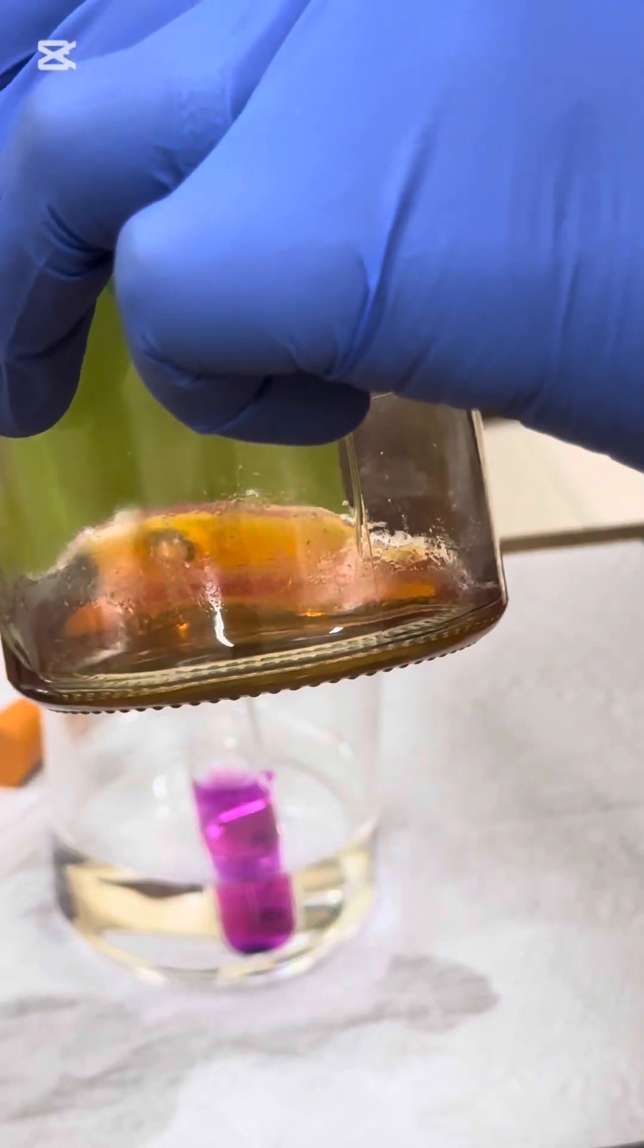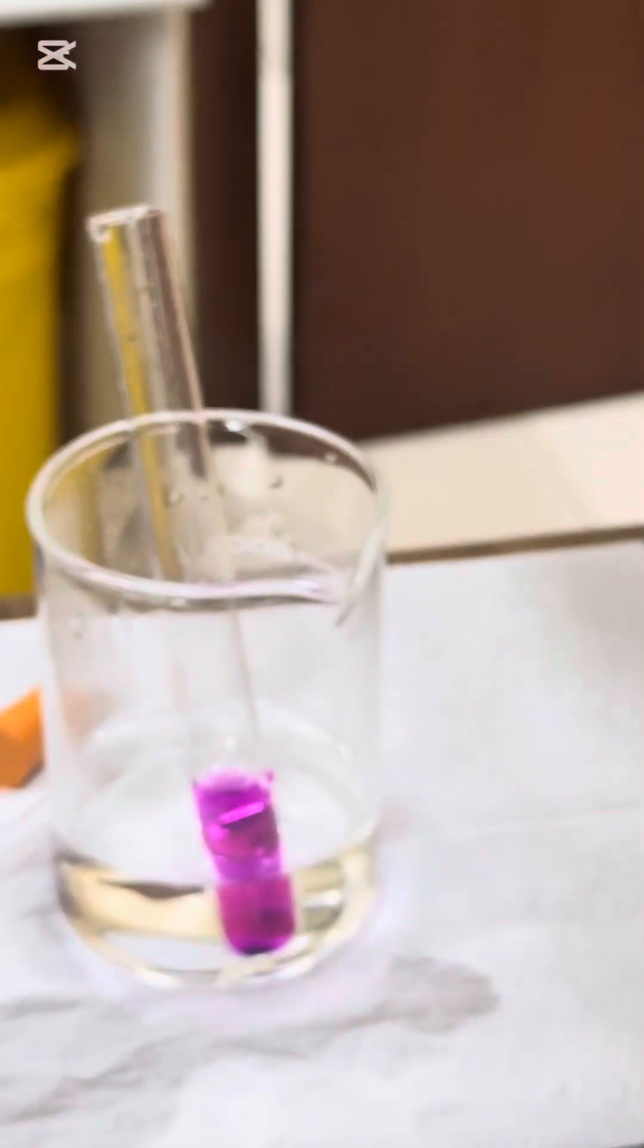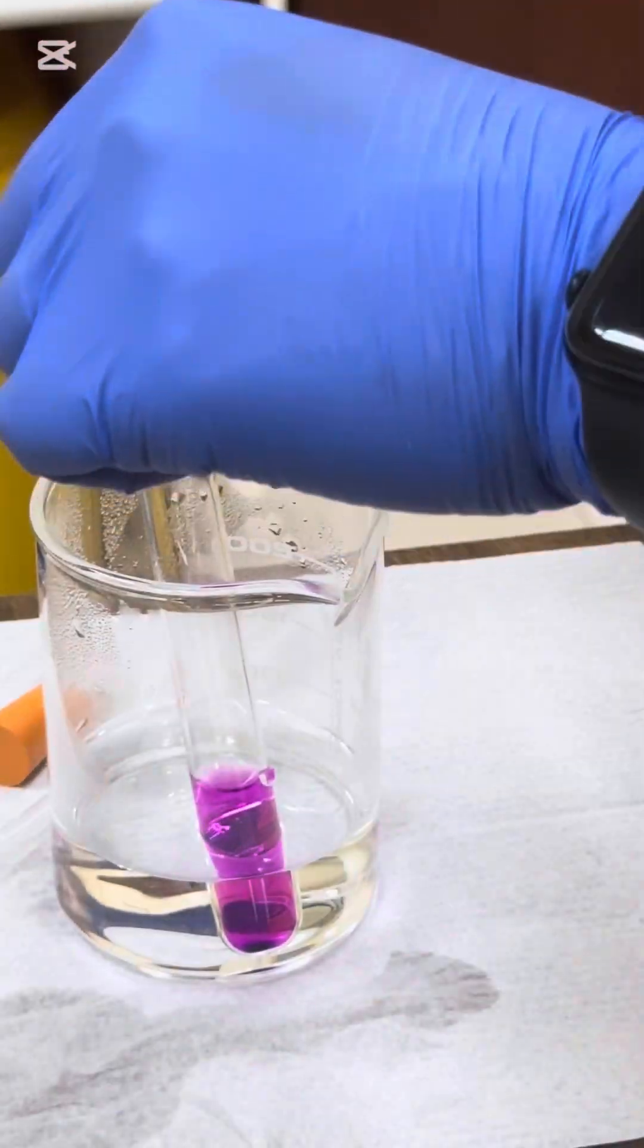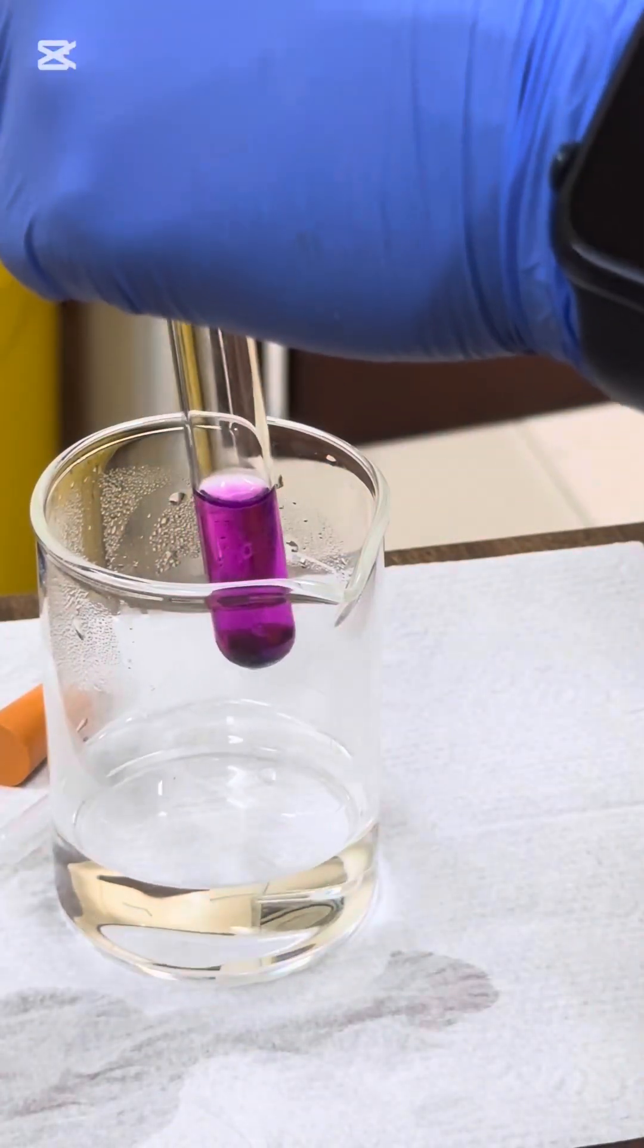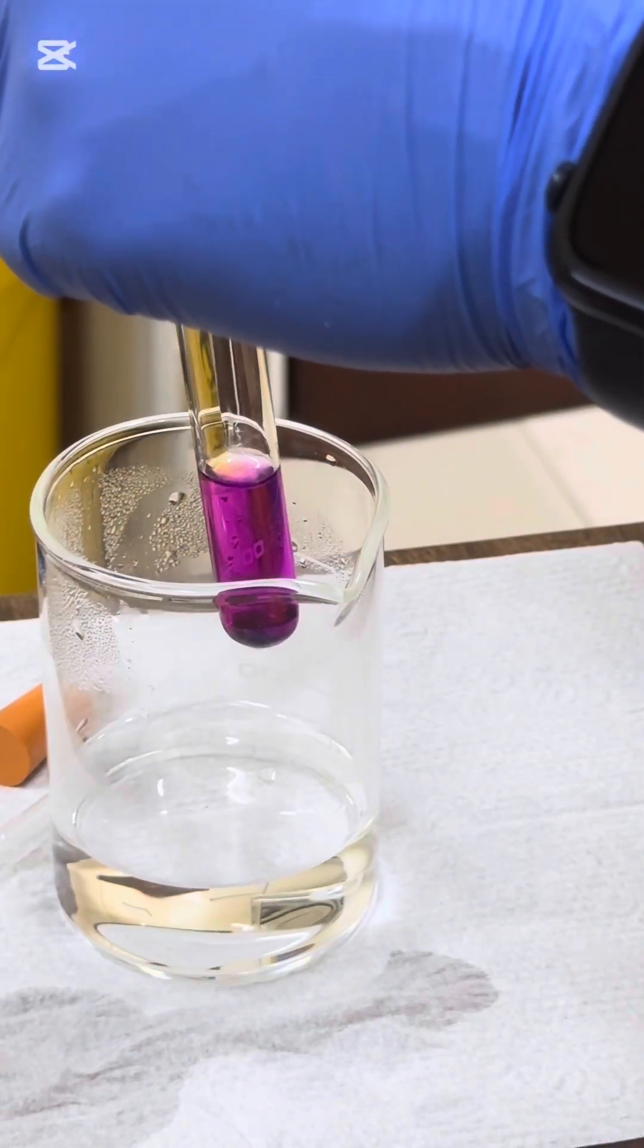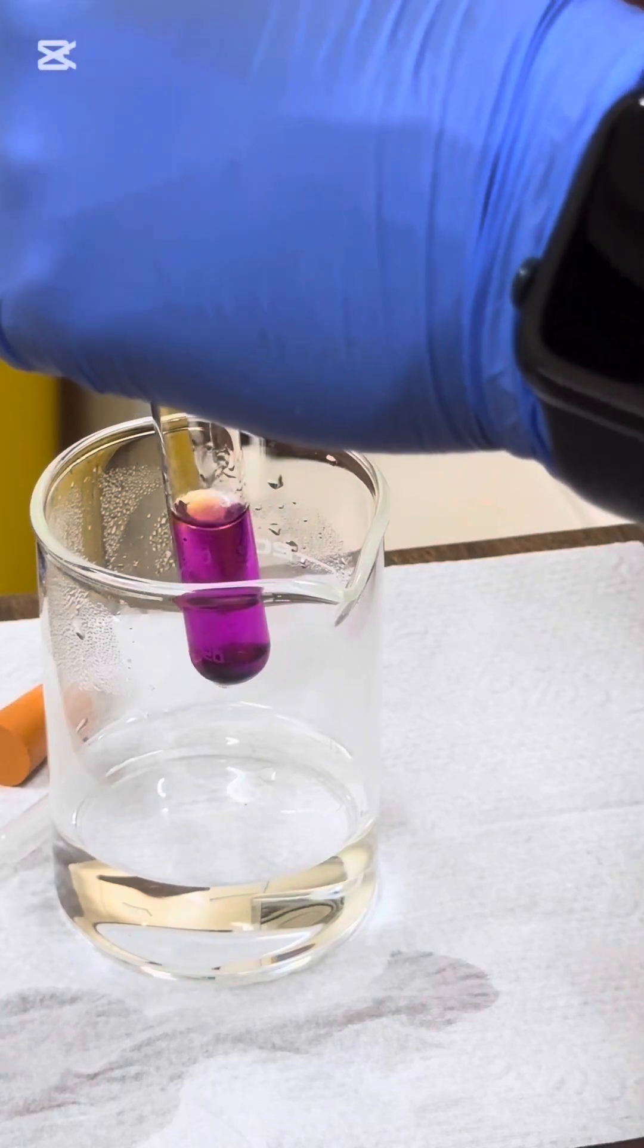You'll see it floating at the top and which part is the aqueous layer. So, I'm going to add my alkene to the potassium manganate 7. You can see it's just right at the top, not shaking it.